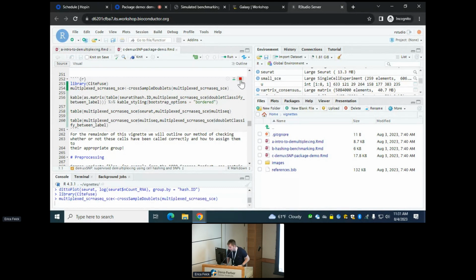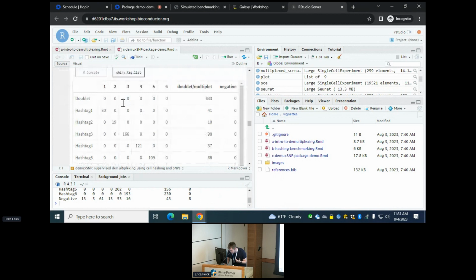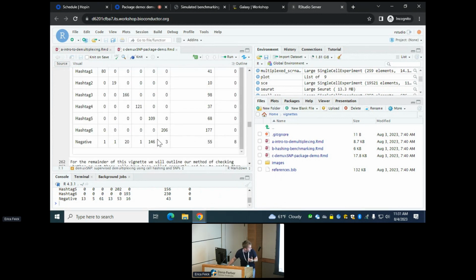So again, as some exploratory analysis, we can apply a couple of different algorithms and see how the results line up. So how is this coming out? That's okay, all on the same side.